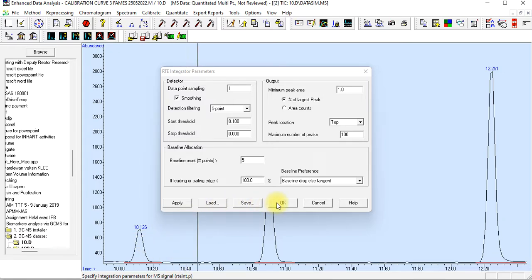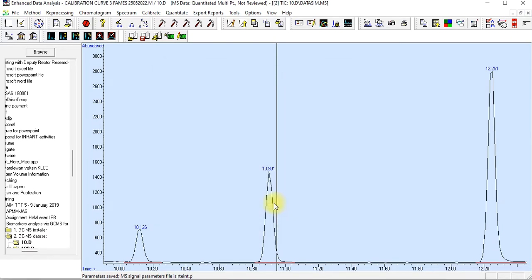Okay, up to that part, is it okay? Boleh? Boleh? So do you find this thing? Boleh? Tiga-tiga, these three peaks already integrated? Correct? Ada issue? No? If there is no issue, I will proceed.